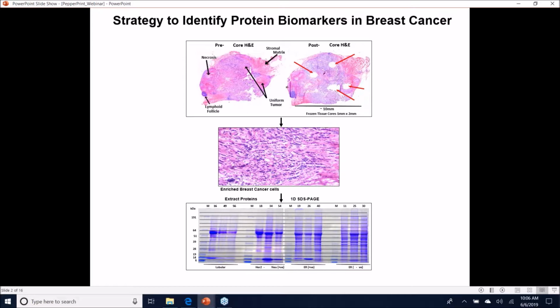Well, at that time, typically the way to identify proteins is you would cut the gel bands, digest with trypsin, shoot in the mass spectrometer, and compare the peptide spectrum against a normal human protein database. So obviously all the mutations are not part of the database. So then you would miss them because the masses would be different. So then we started making mutant-specific databases.